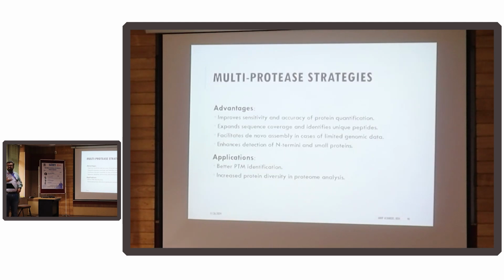So once you have digested these proteolyzed proteins, you have peptides. Now we'll stop using the word protein. Now what we have in our mixture are peptides, and these peptides need to be purified.